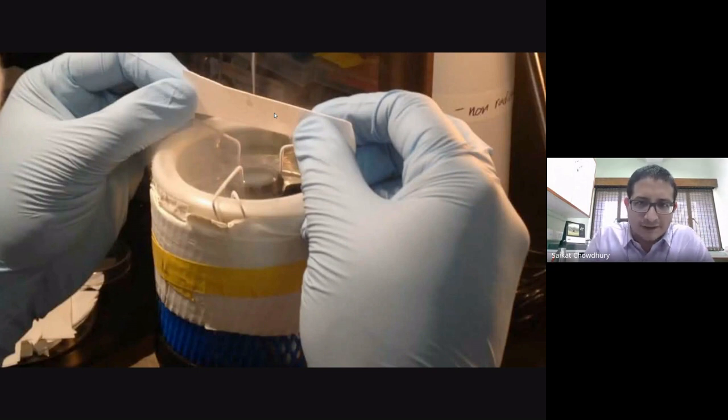But we smack it with the filter paper to reduce the volume left from microliters to almost picoliter level volumes on that grid. So it forms a very thin sheet of ice once we freeze it, and that thickness is enough for the electron beam to penetrate through. If you have all the bulk liquid present on the grid, it will have a very thick ice, and that will be impossible to image.